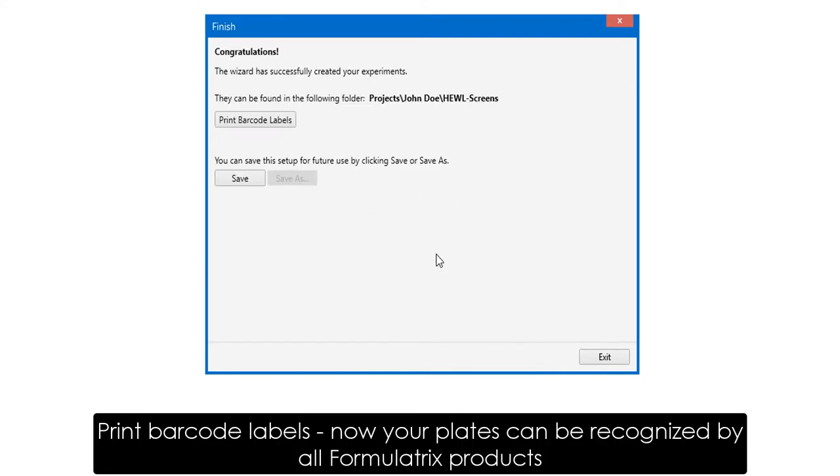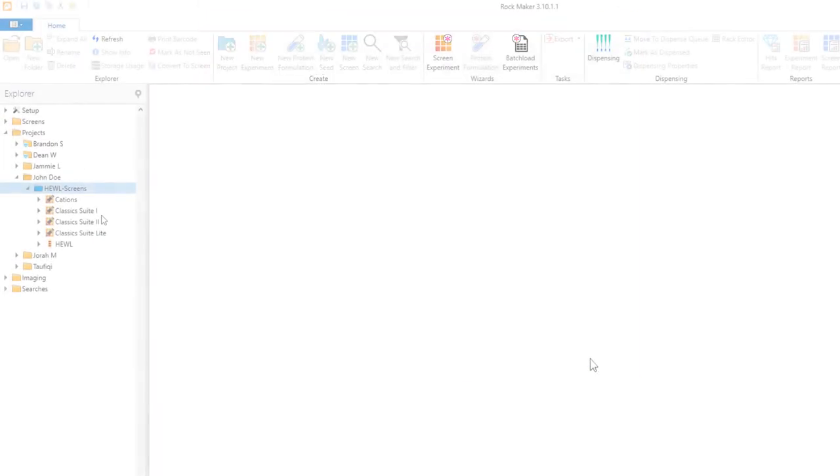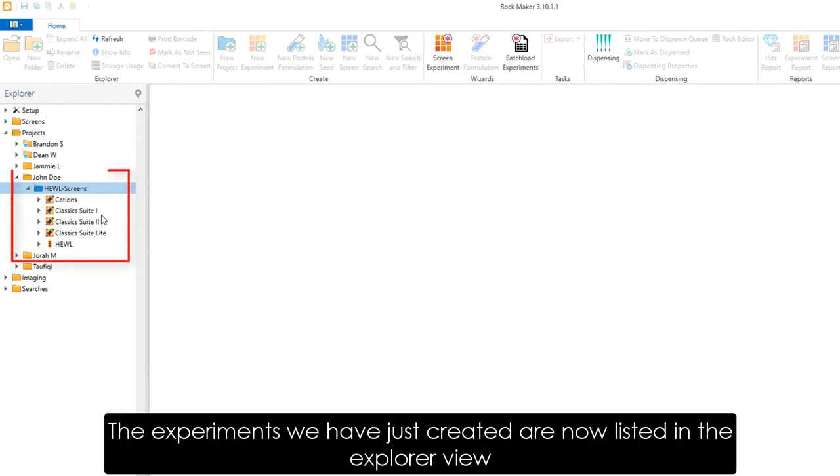You can even choose to print barcode labels for your plates for easy experiment tracking. The experiments we just created can be seen in the Explorer.